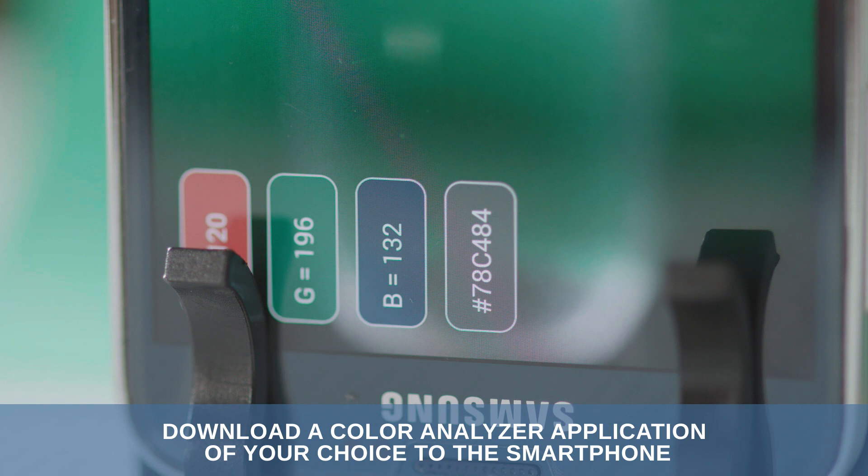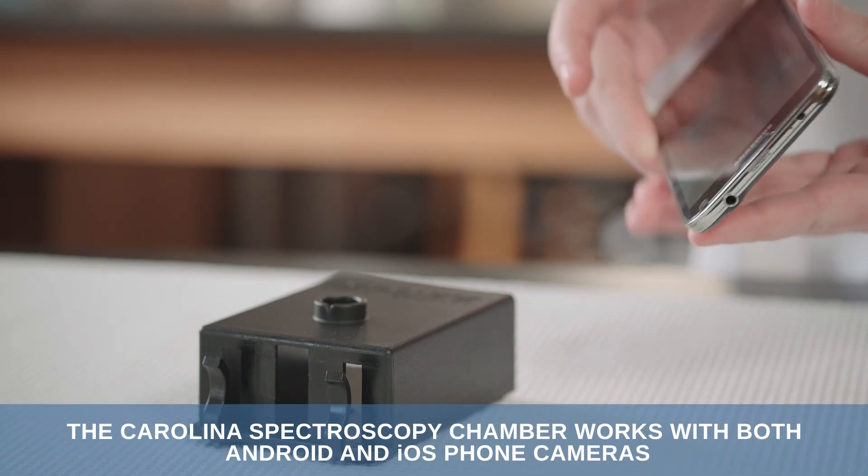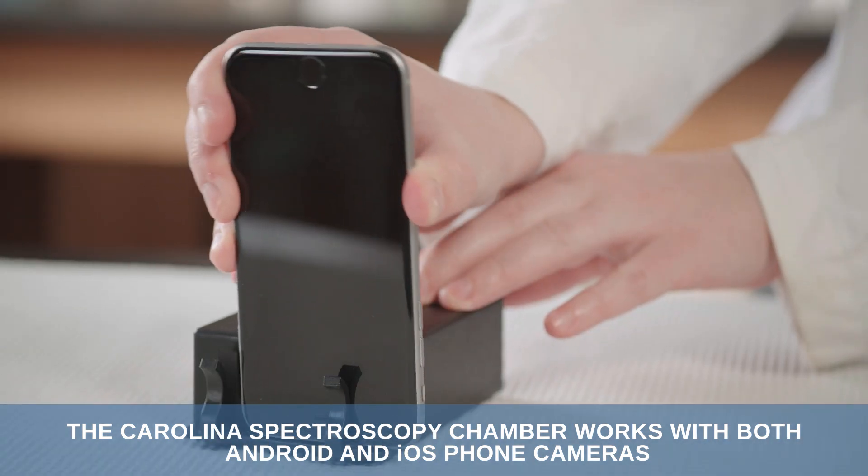Download a color analyzer application of your choice to the smartphone. The Carolina Spectroscopy Chamber works with both Android and iOS phone cameras.